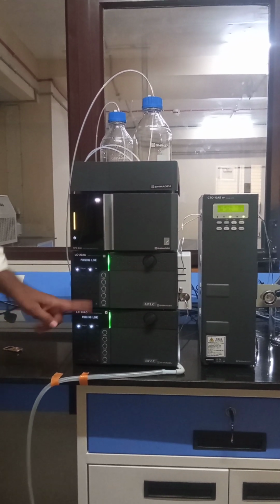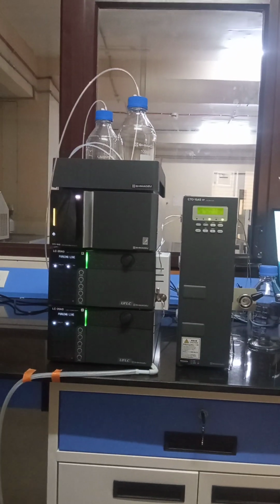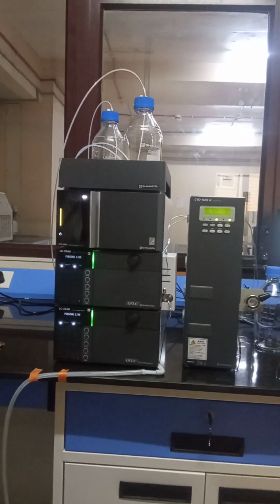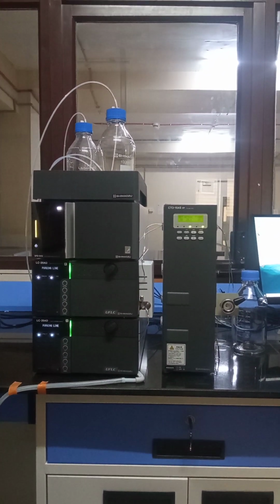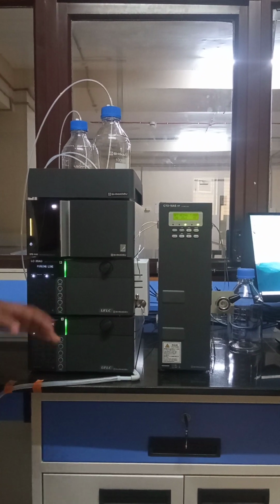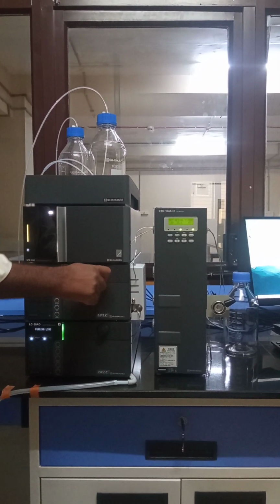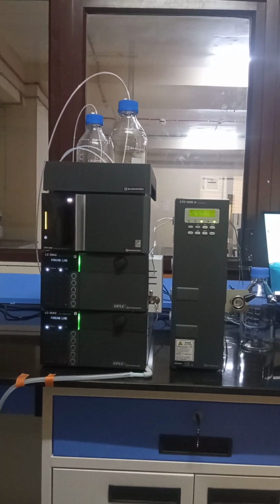I will show you after three minutes. Column next. Sorry, before that we need to connect the column. Before pressing the purge button, before pressing pump A and pump B, you can write one line: connect the required column.